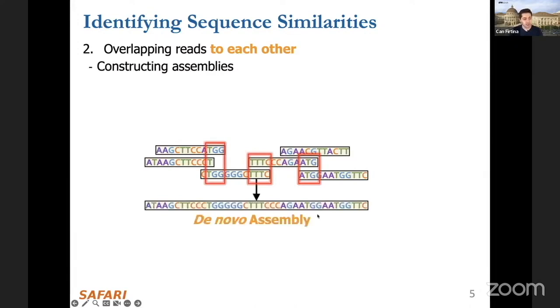This enables us to construct the de novo assembly of an individual without mapping the reads to a reference genome. When mapping reads to a reference genome, the reference could be considered a backbone, a clue where we can look to identify where a particular read may be originating from in its corresponding genome.